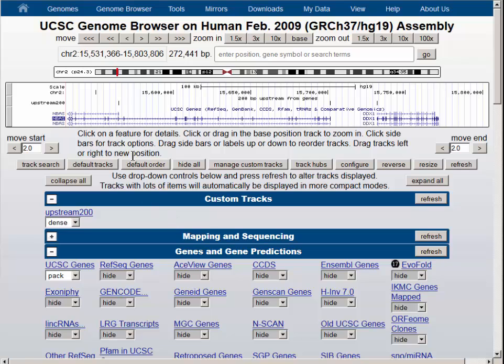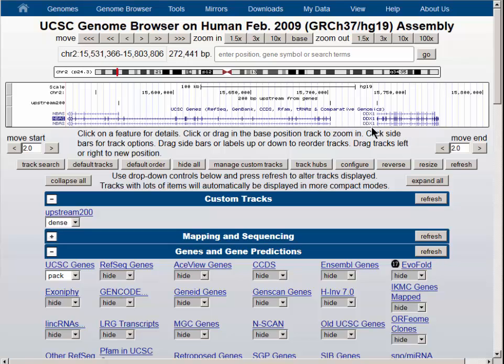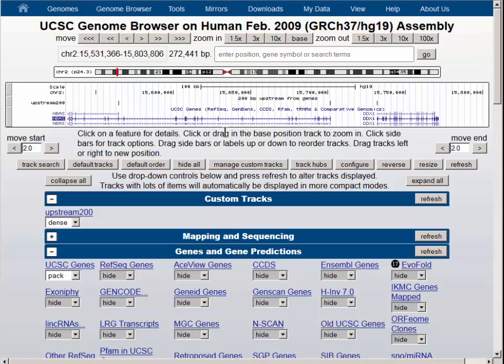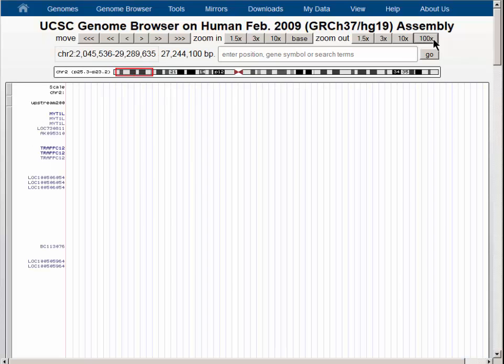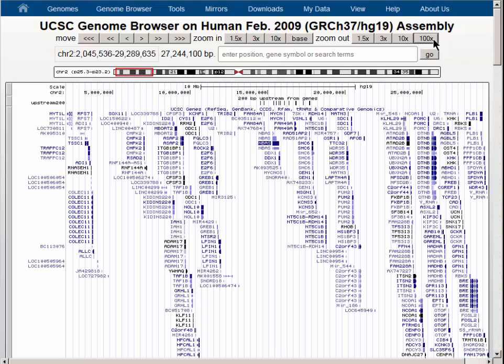Here you can see there's an item upstream from each of the isoforms of each of the genes, including the shorter version of the NBAS gene. Now to intersect this with the SNP track, we want to zoom out and get the same region that we were looking at earlier.